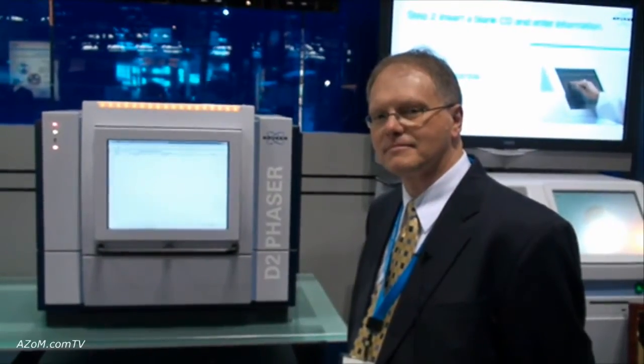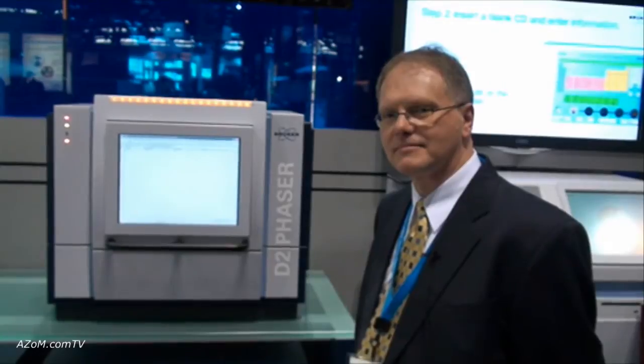This is Cameron Chai from azom.com and I'm speaking to Ray Matajic from Bruker, and he's going to tell us about their D2 Phaser XRD system.